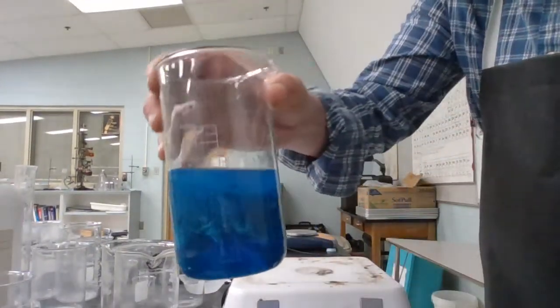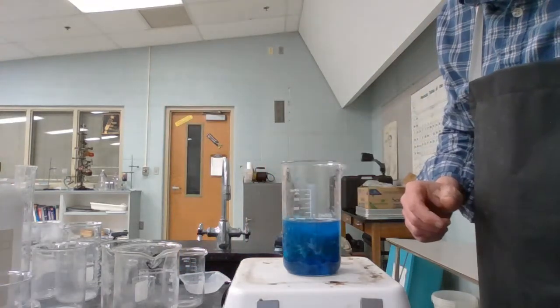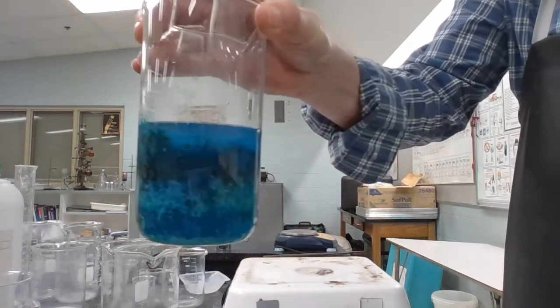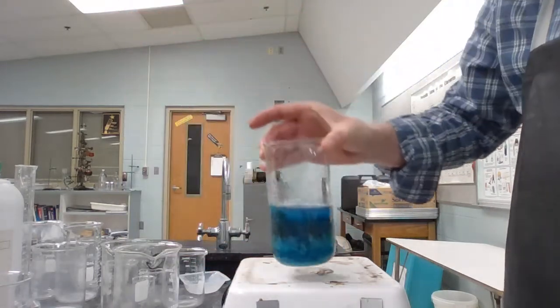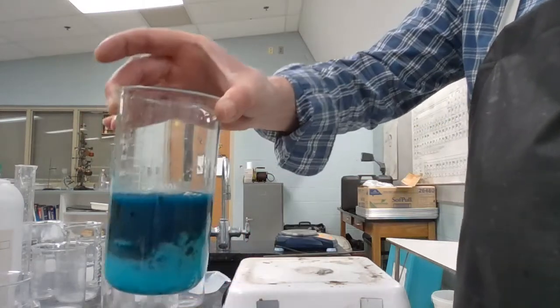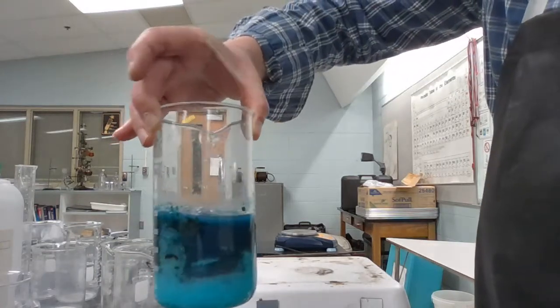Starting to see a color change. A little more color change. Starting to turn black. So we got her changed to a much darker color.